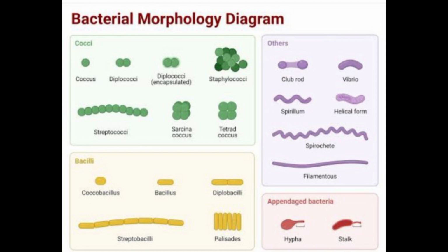Differential staining imparts different colors to different bacteria or bacterial structures. The two most commonly employed differential stainings are Gram staining and acid-fast staining. Gram staining is most widely used in bacteriology. The stain was originally devised by the histologist Christian Gram. Nowadays, a modification of the original Gram stain is used.